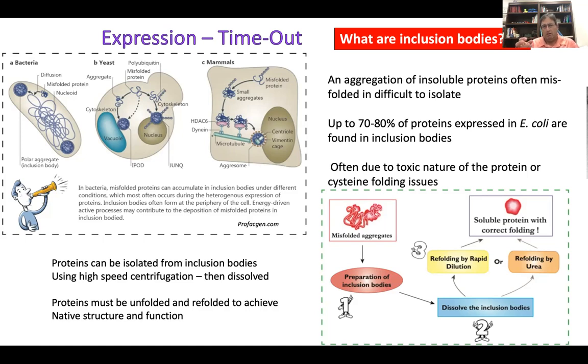They get shuttled into these very sturdy intracellular vacuoles or bodies. They're called inclusion bodies, right? And it takes a while to deposit all these misfolded proteins in there, but that's how the bacteria is saving itself from too much protein in its soluble portion of the cell.